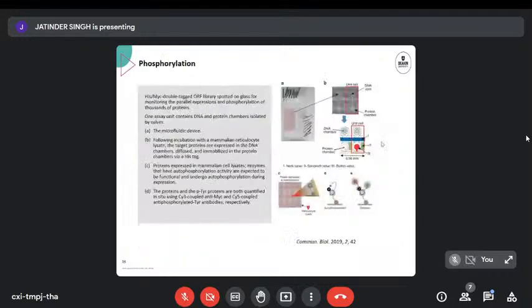Phosphorylation of proteins is as important as glycosylation. And here we have, I think this was an antibody-based one. Yes. So here we're not doing mass spectrometry anymore, but we've got a detection with an ELISA using a phosphorylation reagent.